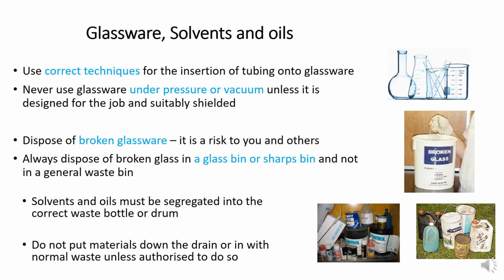If you are working with glassware, it is very important to use a proper technique when inserting tubes into beakers. Mostly they break the bottom of the beakers. So be careful. You should learn proper techniques before working with this glassware.